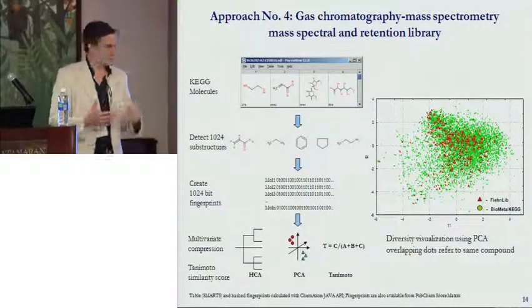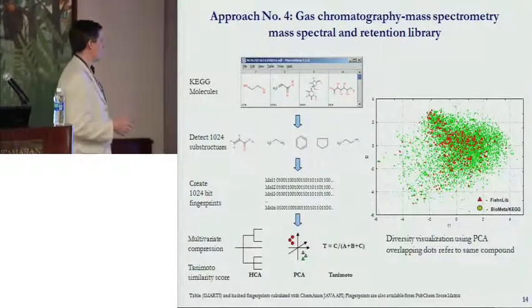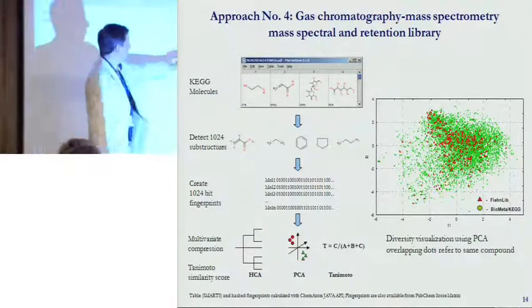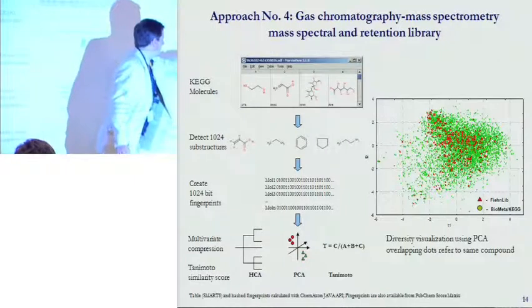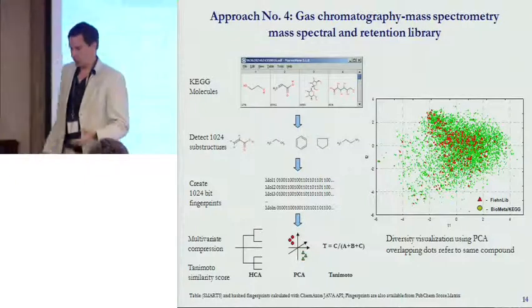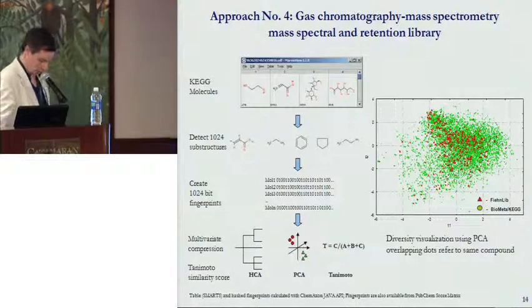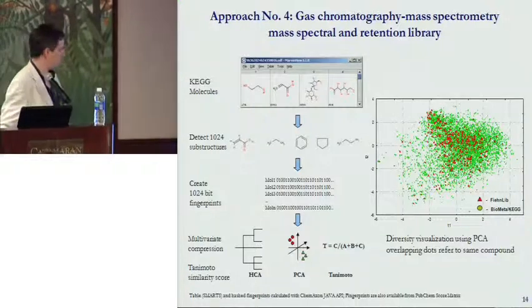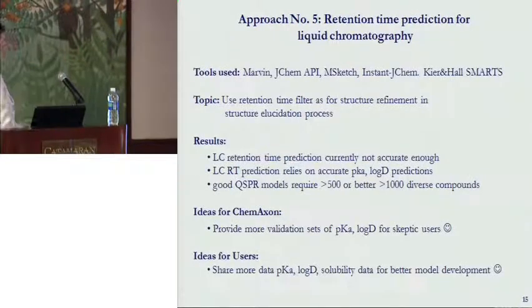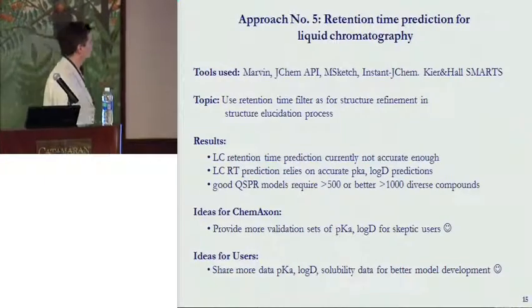And I think that is pretty nice, and obviously people have used it before for visualization of the diversity space. Because if we were only here, maybe in the range of alkanes, although I don't know if these are alkanes right now, that would mean our library is not very diverse, and it wouldn't be very useful. But we have a diverse database, so it is actually useful, and we have already used it several times for metabolic profiling experiments. So these were things we already published or are going to publish.